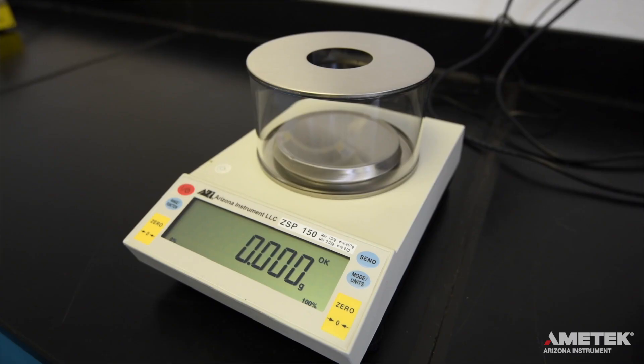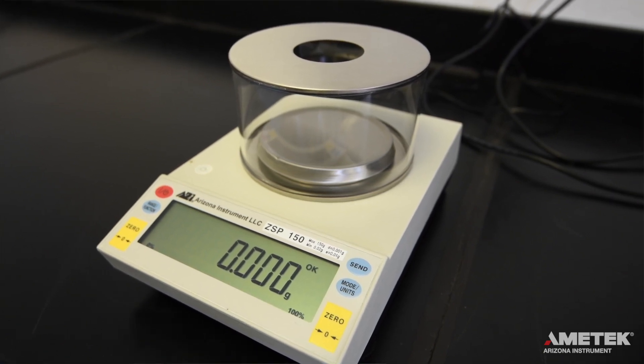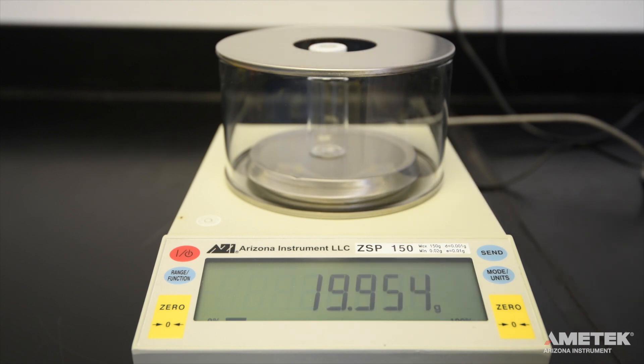For samples that will give PPM or percent water results, you will need to weigh your sample inside the closed vial by either connecting or using an external balance, such as the Amatec Arizona Instrument ZSP-150. The first step to do this is to tare the empty bottle, cap, and septum.